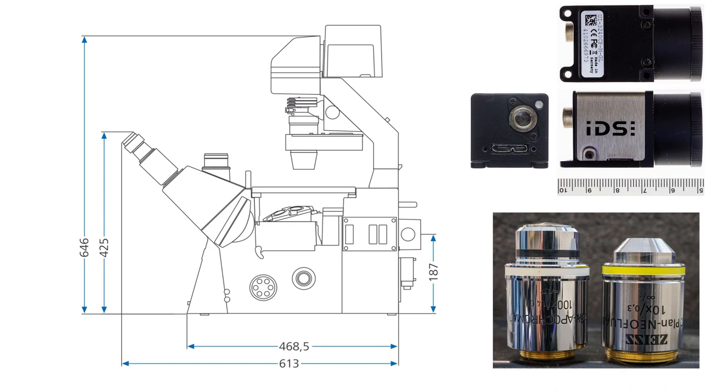When setting up Köhler illumination, we generally have to make the following adjustments. We need to focus on our specimen using the focusing knob. We need to also focus the condenser by moving it vertically using the shown knob. We may have to center the condenser laterally using two thumb screws. And finally, we need to adjust two diaphragms: the field diaphragm, also called field stop or F-stop, and the condenser diaphragm, or A-stop.